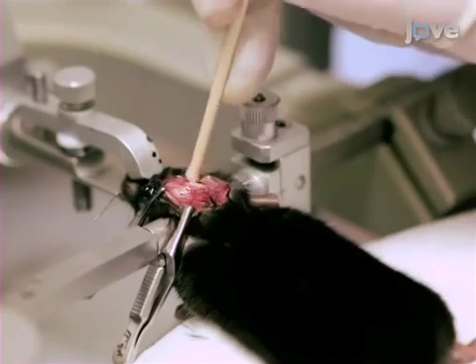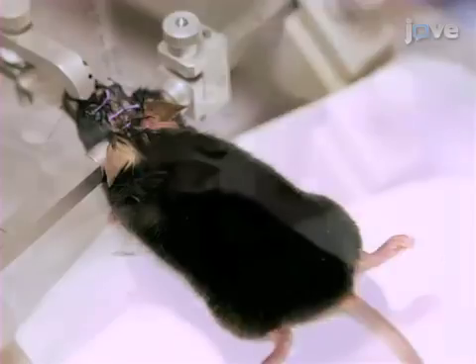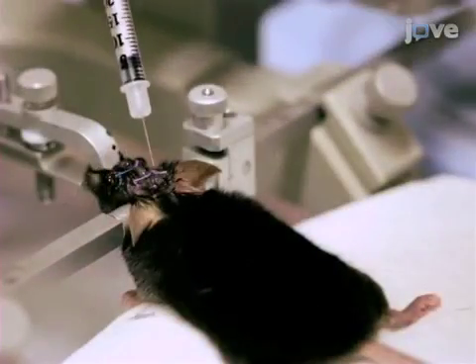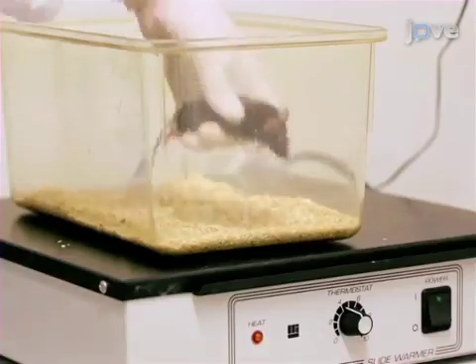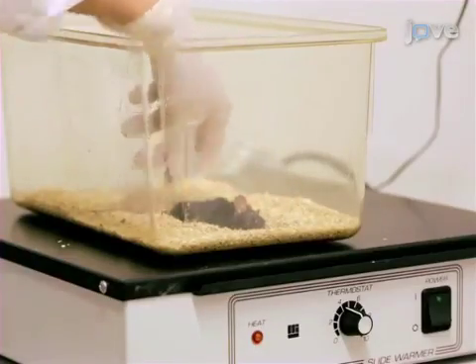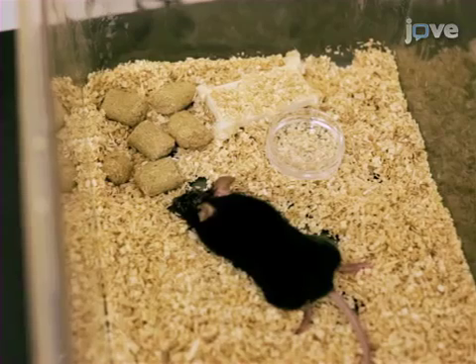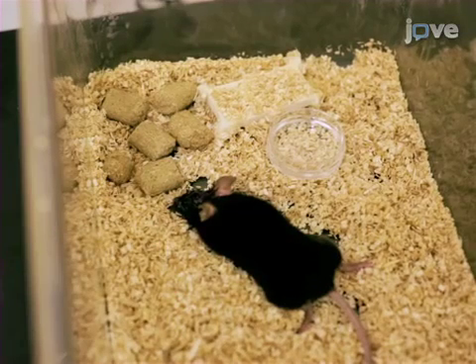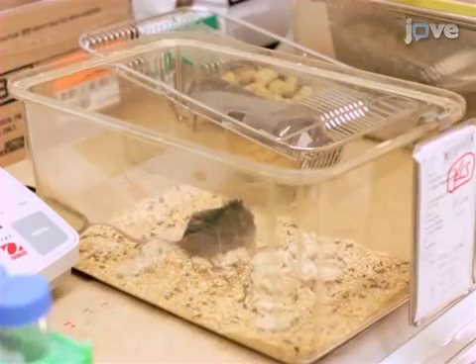When the injections are complete, apply bone wax to seal both holes and then suture the scalp. Apply nerve block to the wounded area. Remove the mouse from the stereotax and place it in a warmed cage on a heat block to recover for 45 minutes to an hour. Let the mouse recover for at least 10 days to allow for maximal Cre activation. Give the animal water and softened food and buprenorphine twice daily if necessary.